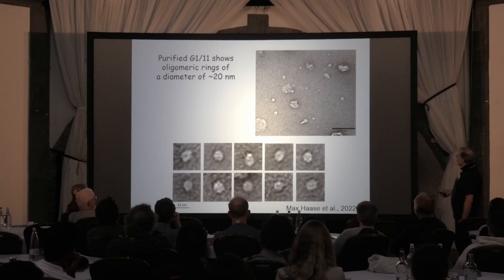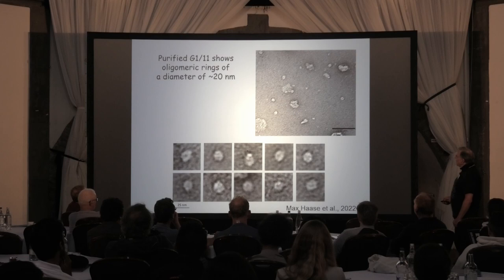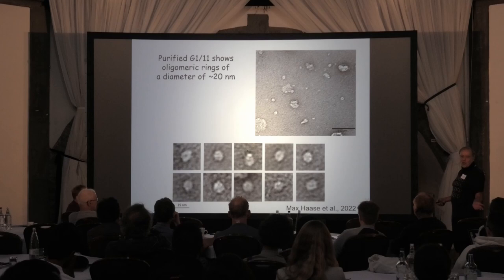Now you can visualize these oligomers on an EM. You see fine structure all over these particles, and if you collect them, you can see that it's probably pentameric, could also be hexameric, so it's difficult to say at this stage, but it's ready to go for cryo-EM now.